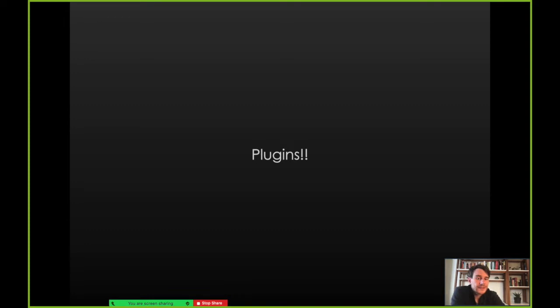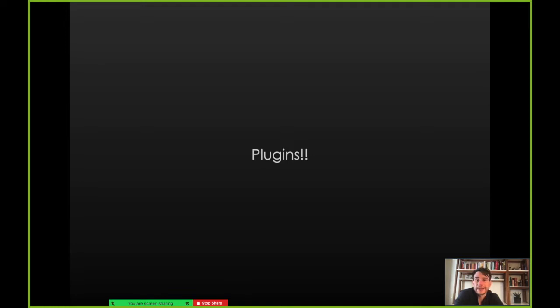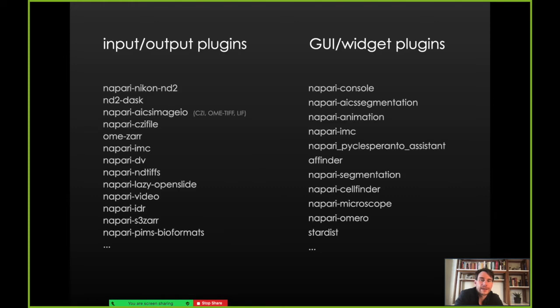Let me talk a little more about plugins and our plugin ecosystem. Napari itself is pretty domain and analysis agnostic — we provide these fundamental objects, layers, and interactivity. But we have a plugin model that allows users to provide custom analyses, custom interactivity, or custom file I/O and other things like that. We've got a number of plugins for reading and writing data, including Nikon files, CZI files, ND TIFFs, and others, as well as GUI or widget plugins for segmentation, cell finding, and more.